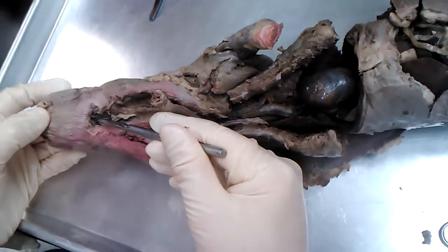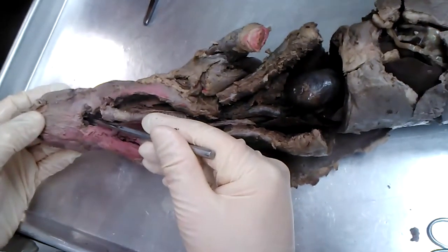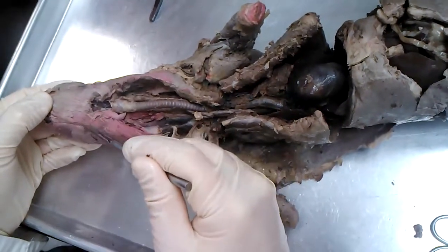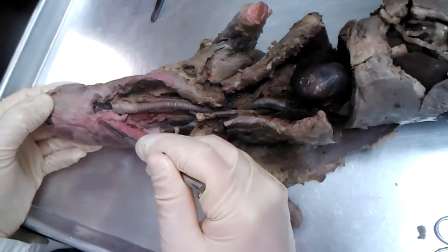Okay, look out. All right, so again, that's the pharynx. Then we had a gland right in here. This is a salivary gland called the submandibular gland right in this region.